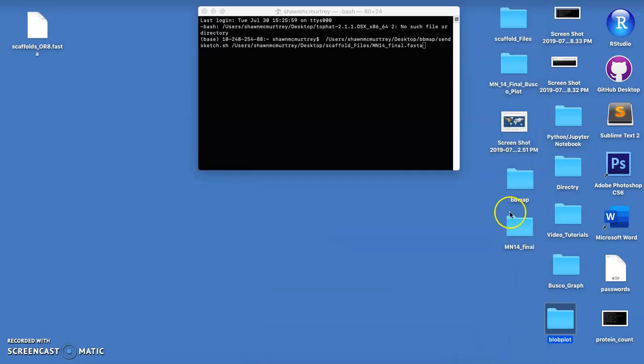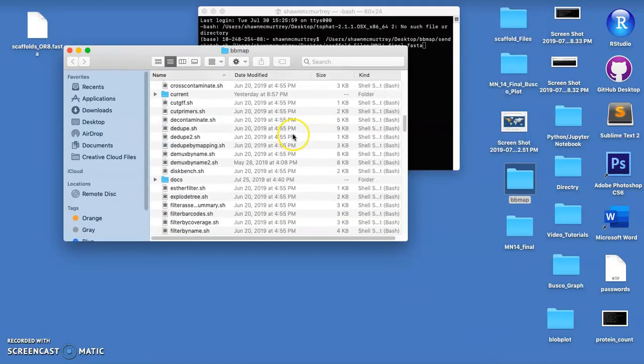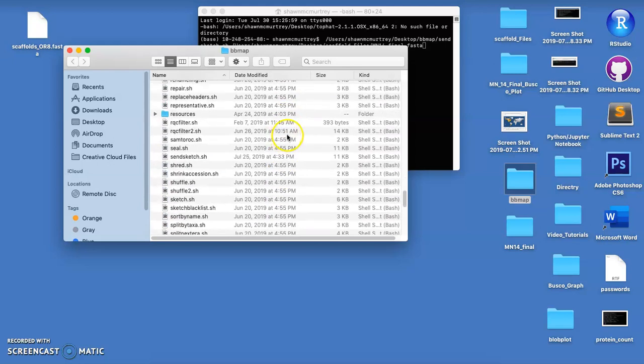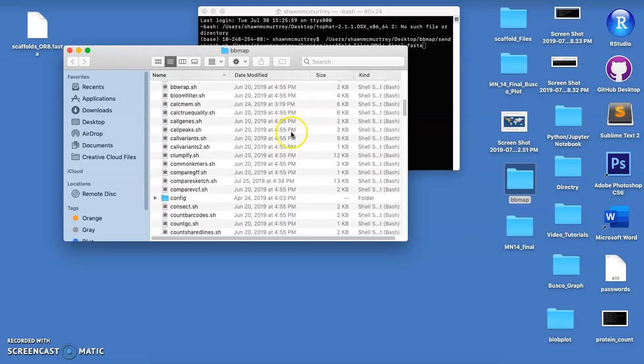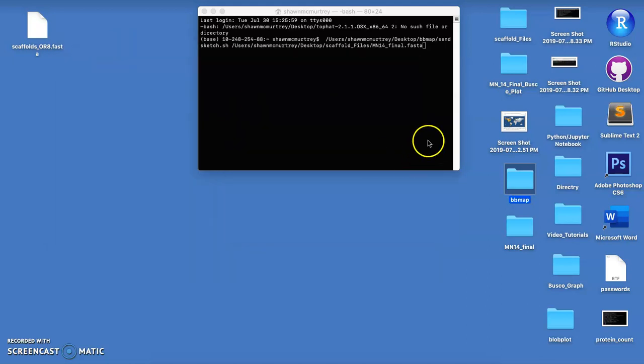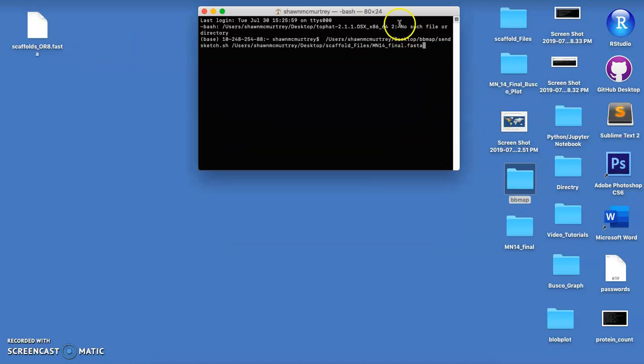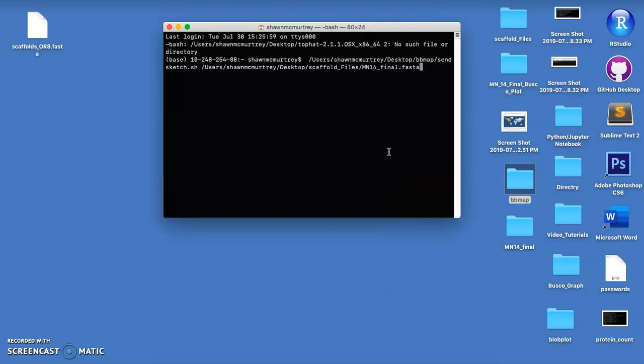Once you do that you'll get this download folder that looks like this with all their different tools, which they have a lot of different tools. I've barely just dipped into what they can do but this one's very simple and very easy to use.